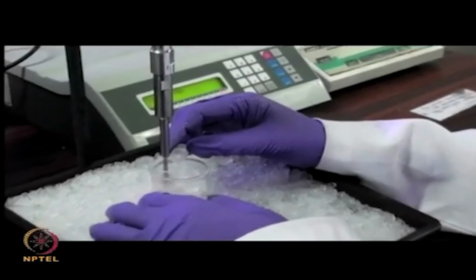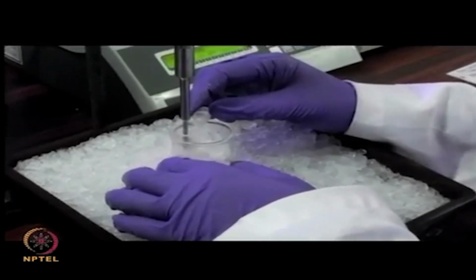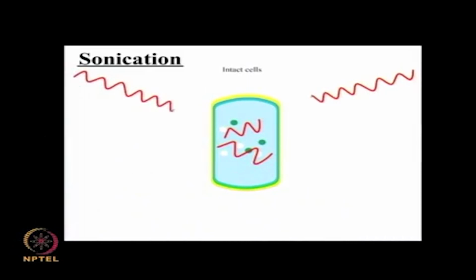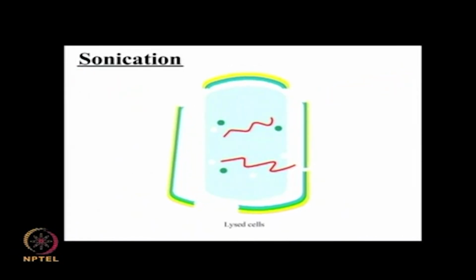Sonication. The resuspended pellet is sonicated on ice to enable the bacterial cells to break open so that their contents are released. Sonication involves the use of high-energy sound waves that are capable of breaking open the outer membranes of cells. All cellular contents, including proteins of interest, leak out of this disrupted membrane.